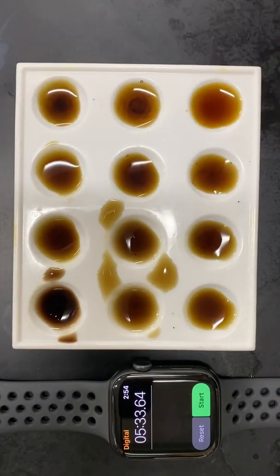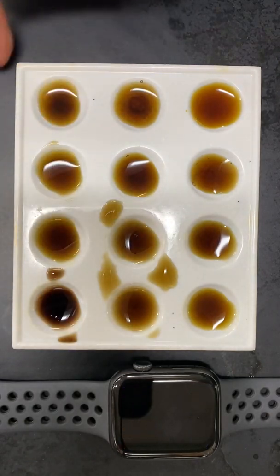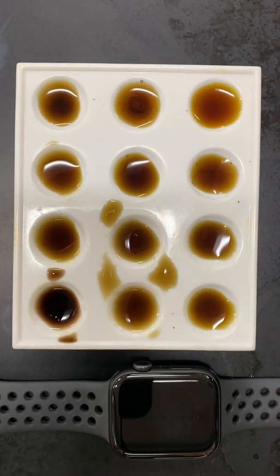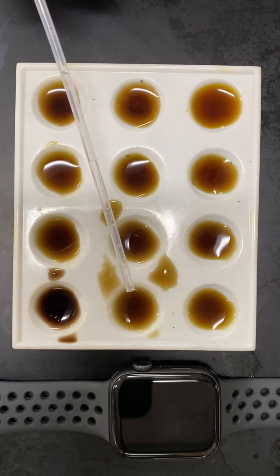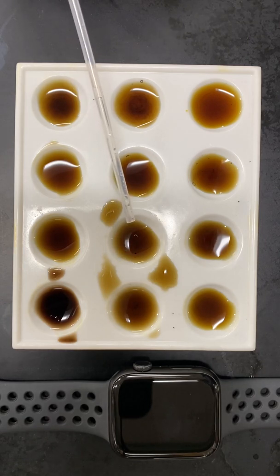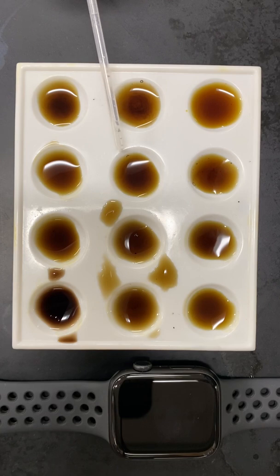All right, so in this situation, it looks like we have the dark, and it gets lighter and lighter. So this spot right here would be 30 seconds. This would be 60 seconds. This would be 90 seconds. This would be 120 seconds. This would be 150 seconds. This would be 180 seconds.